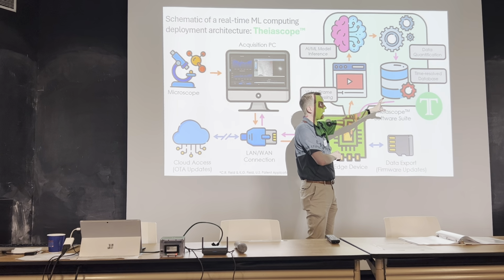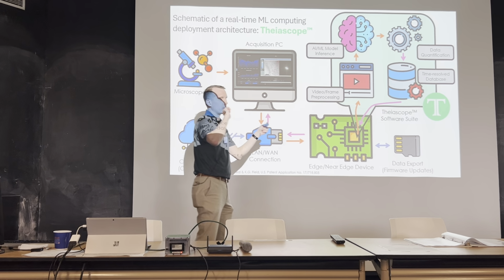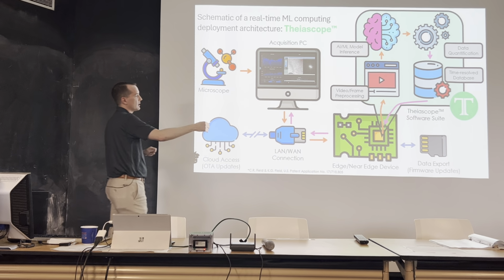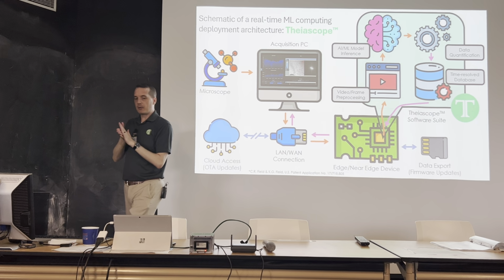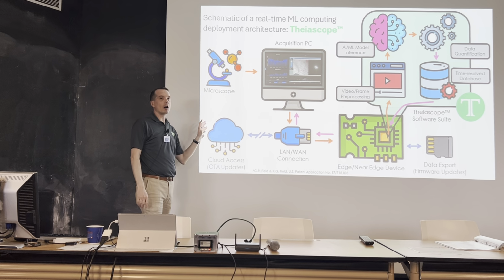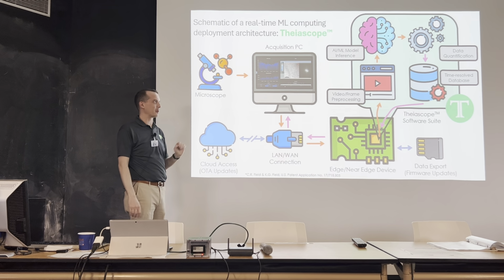We'll use a relational database with a time series component on it so that we can relate our microscope control software, and we can relate all the metadata to the different frames and then to the time as things are collected over time. We will connect everything with a LAN port because all the microscopes now do have LAN ports on them or USB ports. We can use the dongle. And we can also provide over-the-air access if you are in one of those special institutions that does allow you to connect to the internet from your microscope.